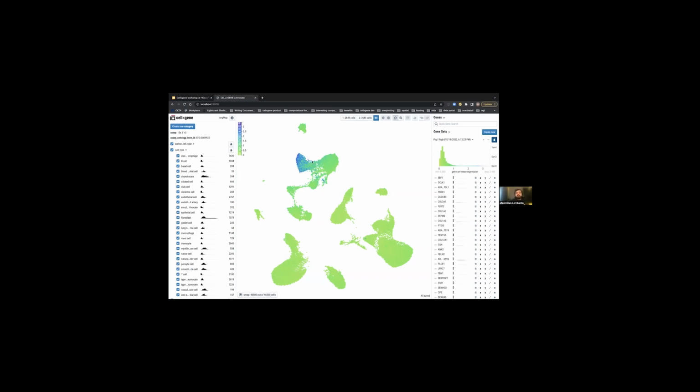And just coloring by the gene set, it looks like there are. I can go ahead and look through this list and see if there are any individual genes. And yeah, there do seem to be some individual genes that are marking this particular population. So we might, in this instance, want to flag this particular set and separate both of these populations into potentially a new subdivision of these fibroblasts. And so that's what we're going to do right now. So in order to do that, I'll just close this to clear up some room.